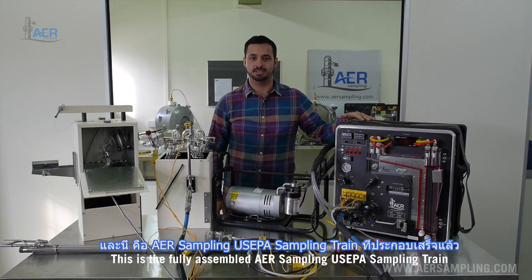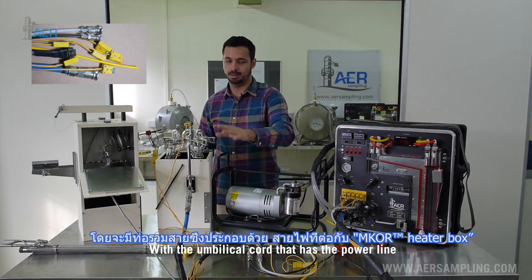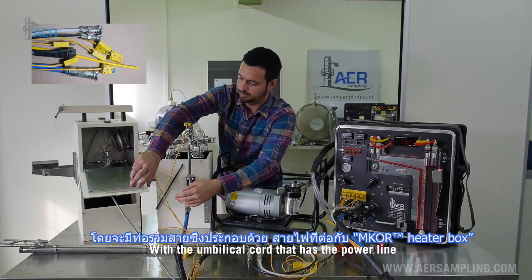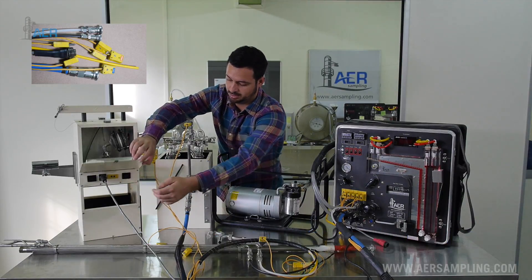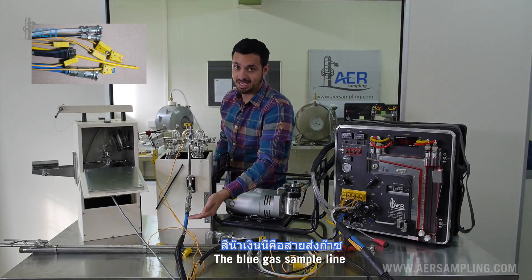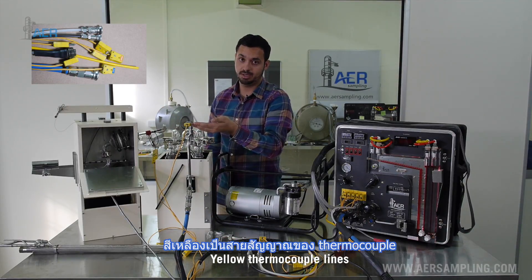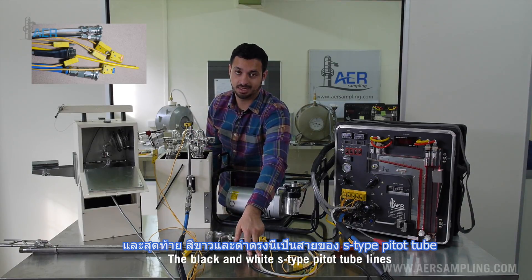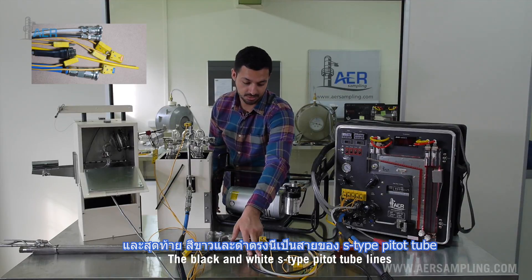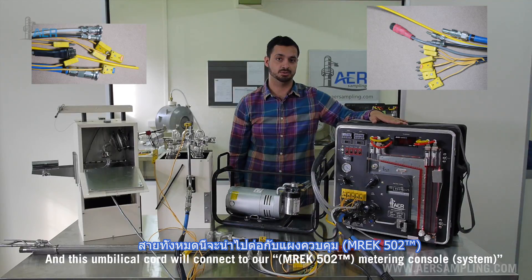This is the fully assembled AER Sampling US EPA sampling train with the umbilical cord that has a power line which powers the heating box, the blue gas sample line, yellow thermocouple lines, the black and white S-type pitot tube lines. This umbilical cord will connect to our metering console.